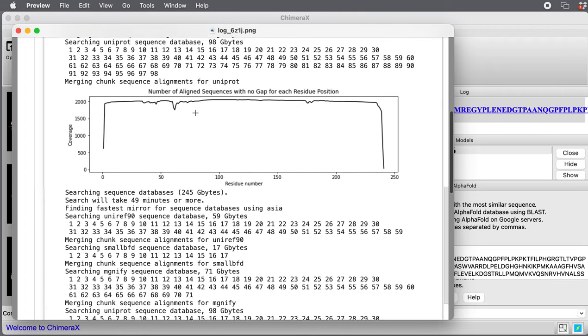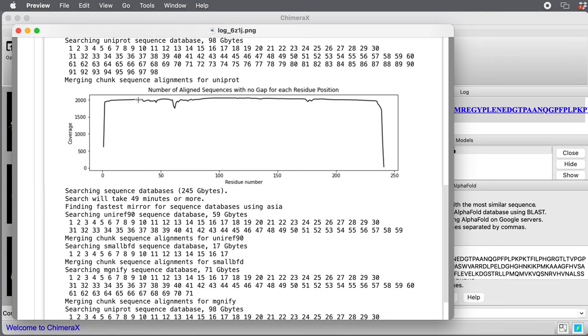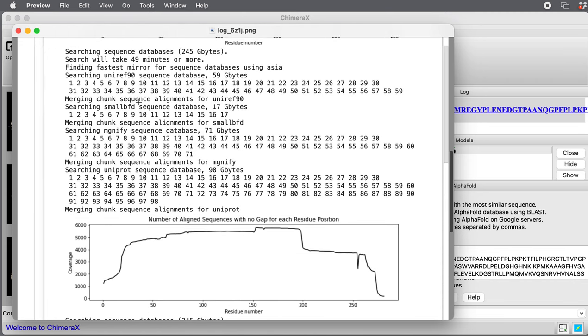Once it's got through searching for one of the proteins, it shows a plot. This is residue 0 through 240 of the first protein. It found about 2000 sequences. At each residue position, it's showing you how many sequences it found aligning that cover that position. That's a lot of sequences.